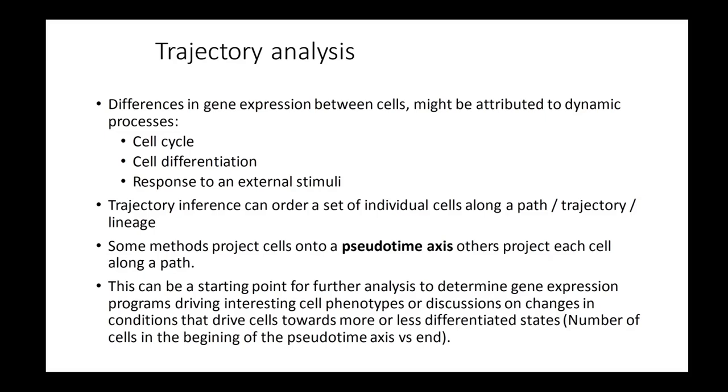This can be a starting point for further analysis, such as differential gene expression analysis, to understand which genes are very high at the beginning of the trajectory and which are very high at the end. And this can then drive more hypotheses and a further understanding of the cells and the data sets you have.